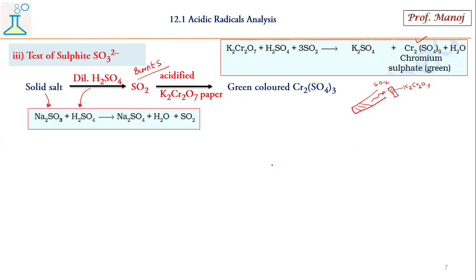Any doubt in this thing? Go through the first test, which is the dry test.